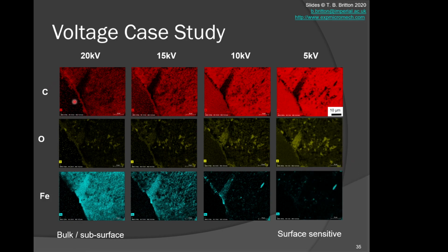So we can see that by playing with different voltages in our experiments in SEM, we can understand the structure and variation of these thin films on our substrate and interpret that. We did a range of other bits and pieces with cross sections with focused ion beam and a few other things to understand the structure of these microstructures.